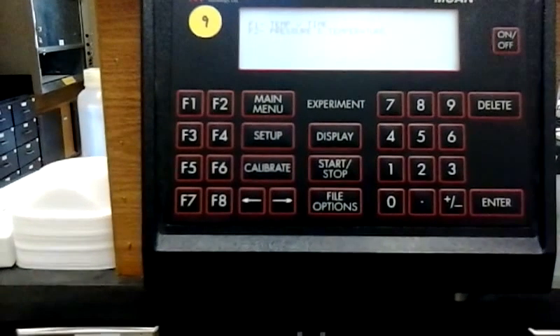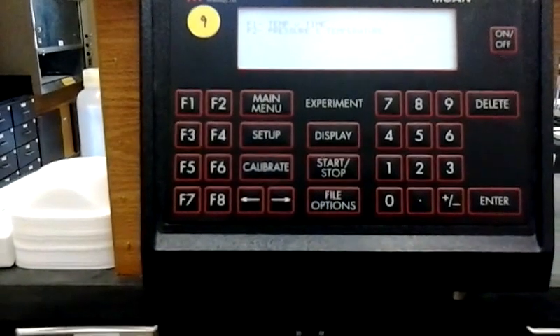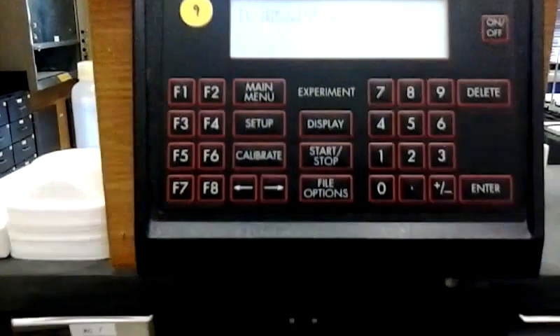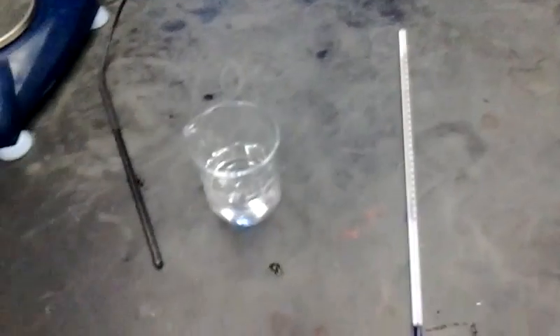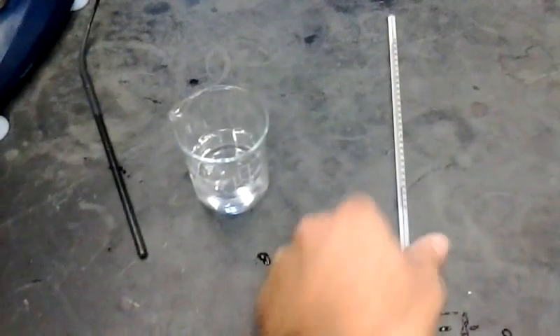Now we're ready to be using the MeasureNet. But first, what we have to do is come back down to our beaker of water and thermometer.